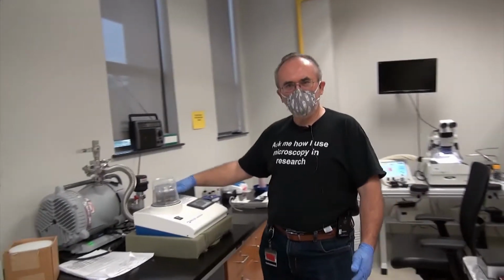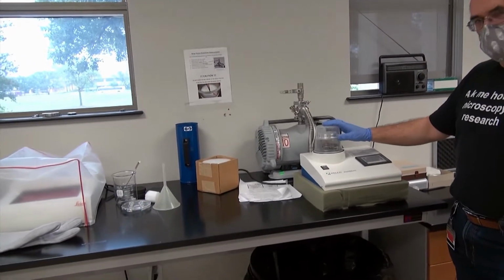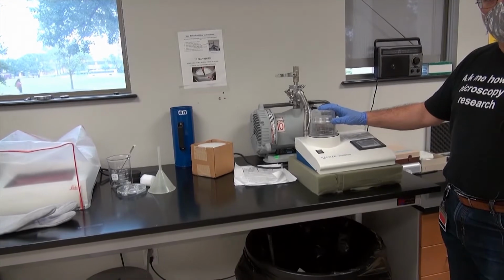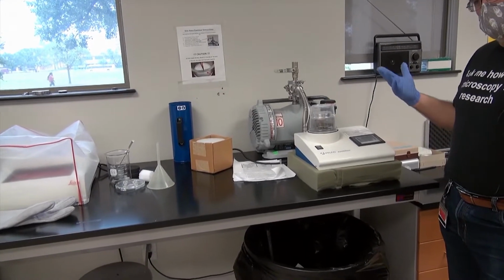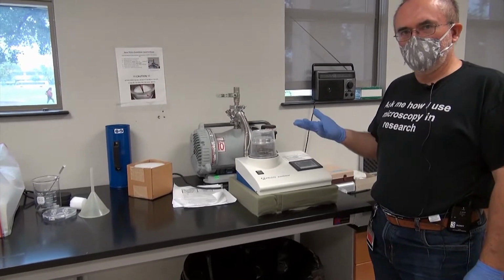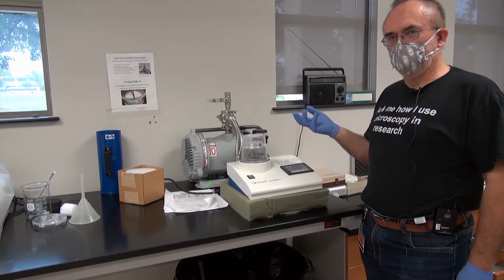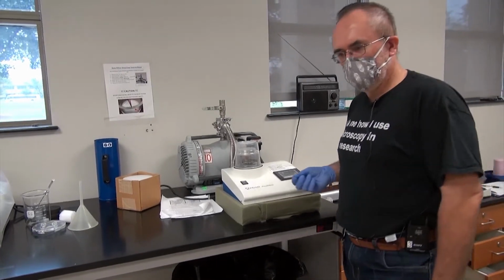Another, a much smaller accessory, but very useful, is this PELCO easiGlow Discharge Apparatus. And this is used to render support film like Formvar or carbon on the EM grid hydrophilic so that your aqueous sample disperses properly.